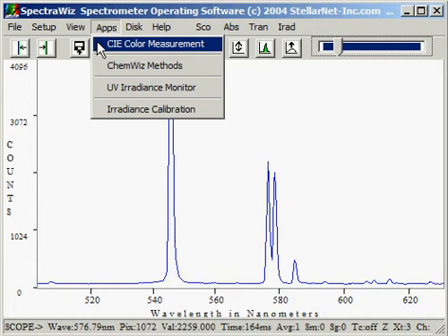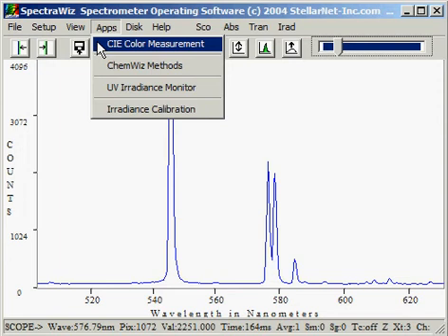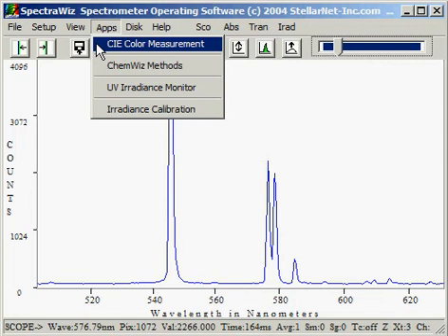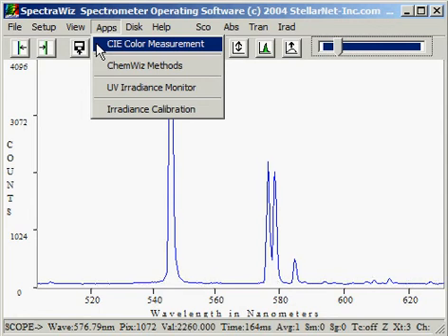CIE color measurement allows two different types of color measurement to be made depending on the mode you're in. If you're in transmission or reflectance mode, you will be able to measure CIE Lab values. If your spectrometer is calibrated to be a spectroradiometer and you are in irradiance mode, this will allow you to measure the color of light using the XY chromaticity diagram.